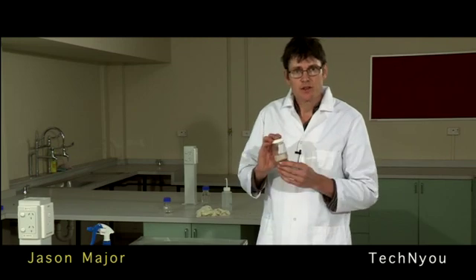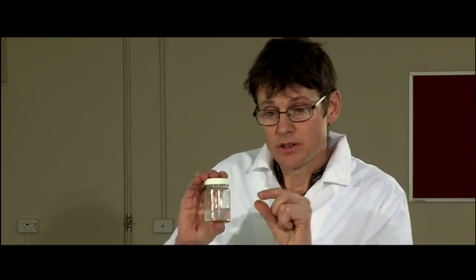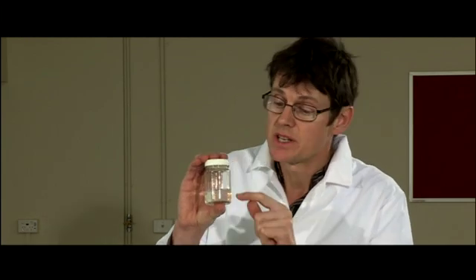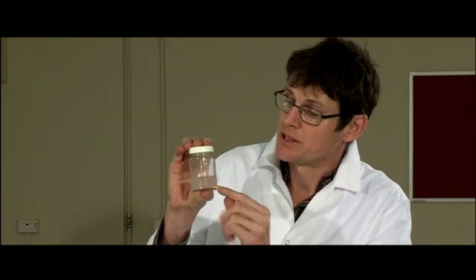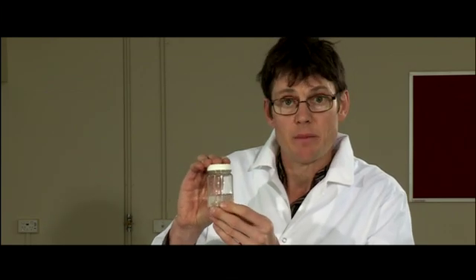Plant micropropagation. This is a very cool way of growing plants without soil. Scientists use it to grow whole plants from just single cells. Or they can use tiny little shoots of plants which they stick in this stuff here, which is nutrient agar medium. I've already prepared this earlier. You can do it as well — it's very easy to do. All the instructions are on the activity sheet. Now we'll come back to this later.